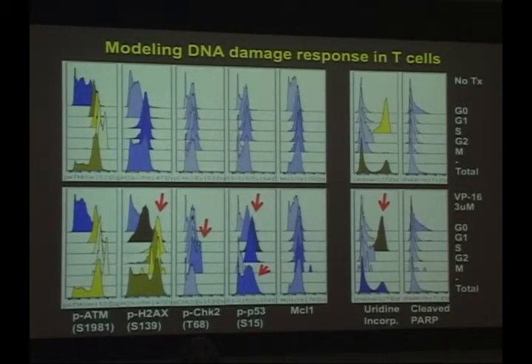And so lastly, what can you do with this information? This is a different project that we're working on as part of a large collaborative focus. But you can see if you subdivide, these cells were in vitro cultured lymphoma cells treated with chemotherapy. But if you cluster cells by their cell cycle state, you'll find that a lot of things that you sort of think of as looking at across whole populations are actually quite different in different stages of the cell cycle.